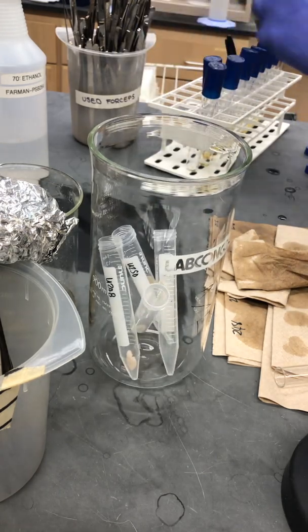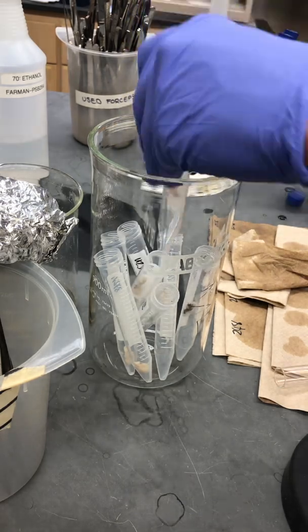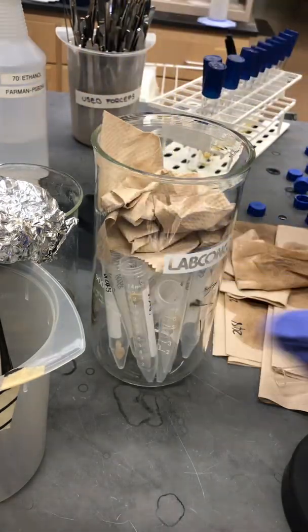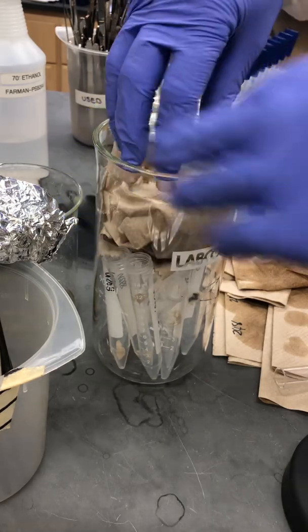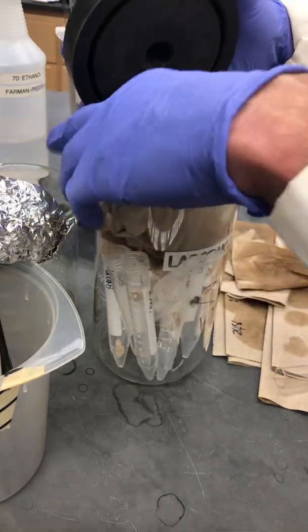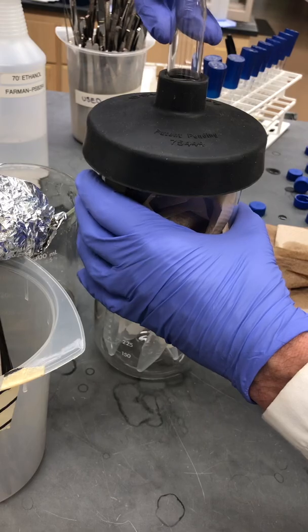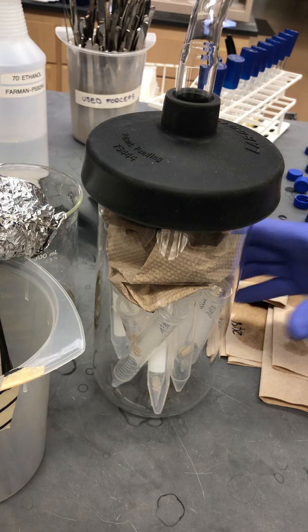These will all get stacked into the freeze-dryer flask with the tops removed to make sure they can dry out properly, each one stacked in the bottom. One very final and important step is to place some towels in the top of the flask so that when we release the air back into the freeze-dryer, the flow doesn't go directly down into the tubes and blow the mycelial pellets out — we wouldn't know which sample is which. We'll seal this up, put on the neck, and it will go into the minus 20 freezer for a few hours to freeze the pellets before going into the freeze-dryer.